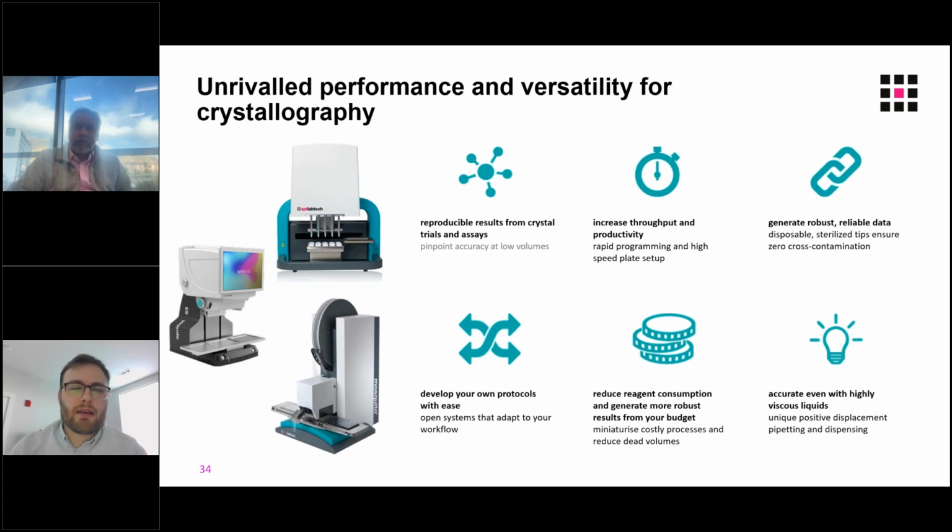SPT doesn't really make crystal screens, so it depends exactly on the screen in question. Between uses though, you can foil seal or plastic seal the top of your crystal screens or the plates you've made to keep them clean. We recommend, of course, also spinning down these plates before they are used.